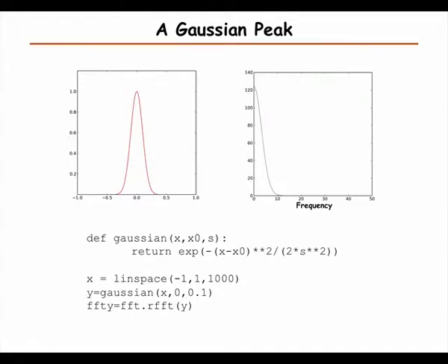So now we can look at just the Gaussian to start with. A peak that follows a normal distribution. Below here, sometimes I'm showing just code, so you can see how quite easy it is to generate these distributions. And you'll know when Himanshu's back next week, he's going to go through in more detail how to use these and more about the details. But you can even from these small snippets see that it's quite straightforward to do this.